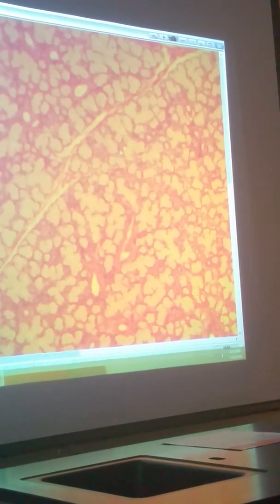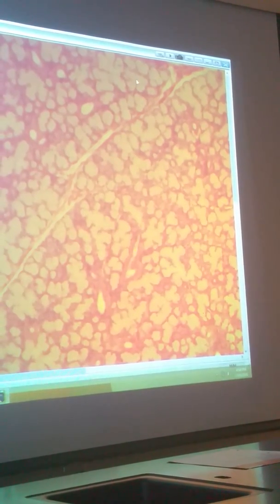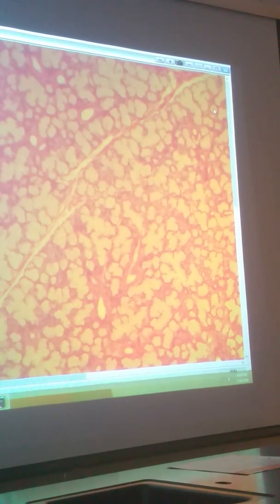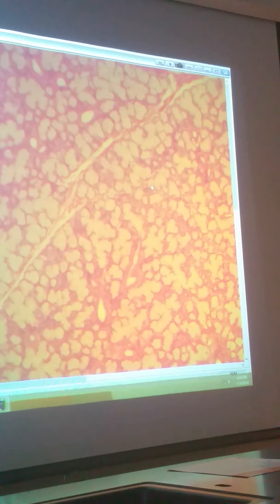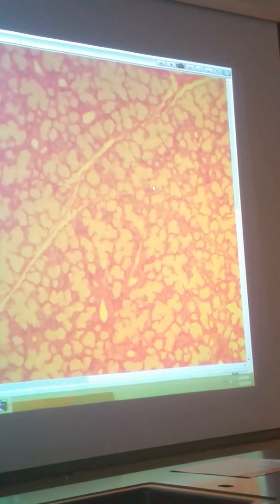And what would you call this, Kamani? That would be a mucus acina. What would you call this right here? Cell of the mucus acini. What would you call this right here? Cell. Okay, good. Beautiful. What about the gland duct?